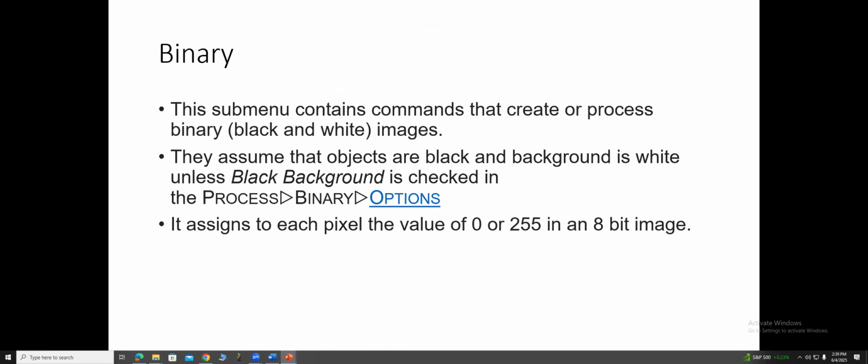So computers work in a binary code, right? 0 and 1. In our case, it's going to be 0, 255. Sometimes I will say 0 and 1 because the idea is the same, right? You want to make sure that you have signal and no signal. And you want to threshold your image in a way that you can really nicely separate out what's signal and what's not signal. The reason why you want to do that, because then afterwards you want to generate your structures that are the ones that you are analyzing, okay?